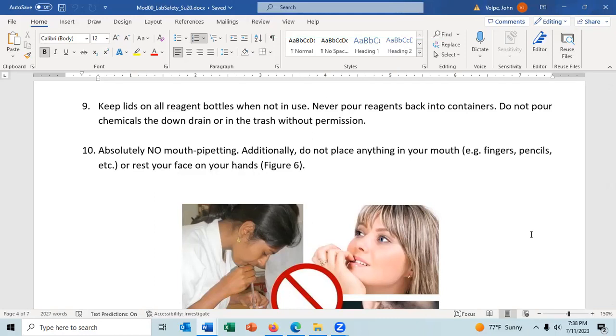And that is disposed of appropriately. I'm not sure what they do with it, but they will get a large vat of it and then call somebody up to come and pick it up, and it's treated as a biohazard. So it's not poured down the drain, and it's not buried with the normal trash. I'm not sure what they do with it. They probably either incinerate it, or they put it in a special burial site with other hazardous material.